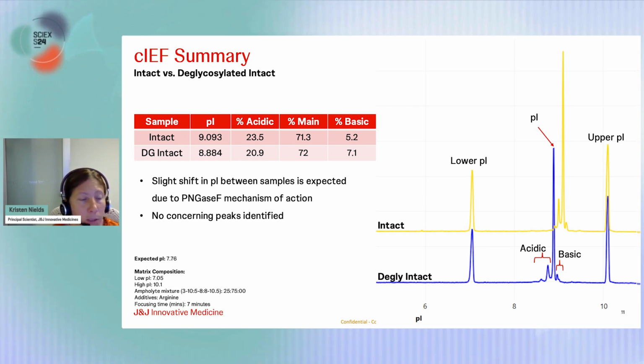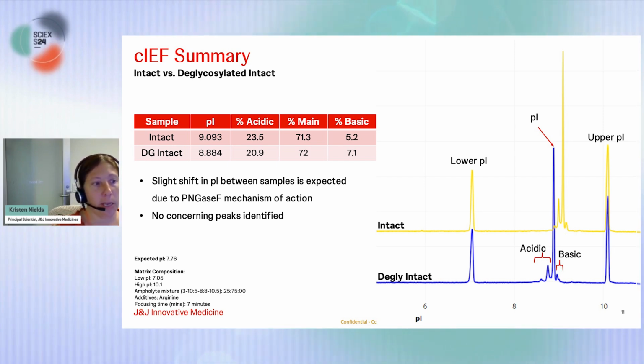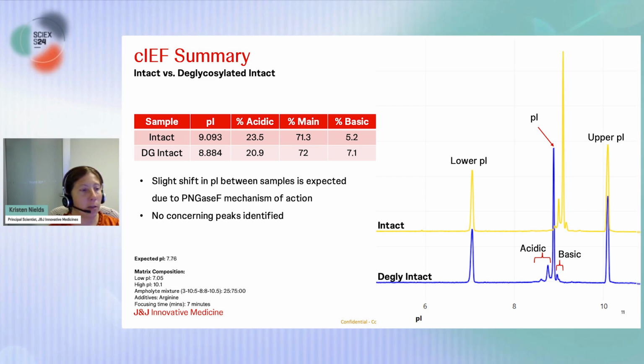There's been a lot of information that we have gathered over the past 3 years on sample prep and different enzymatic digests, on how we can further streamline our characterization of these charge variants, which becomes pretty critical at time of cell line selection and also during a clinical manufacturing campaign, because we're able to go in definitively and, without fractionation, pretty much pull that apart and say, without a doubt, it could be deamidation, it could be glycation.